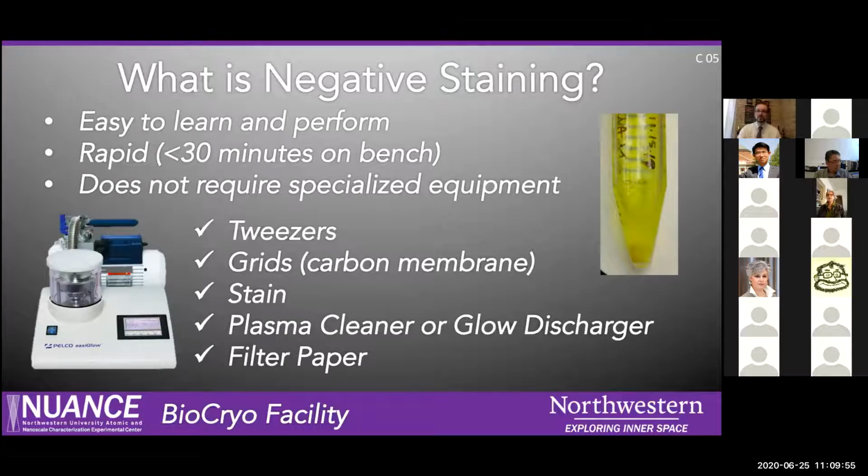It's quick to use as well, and it doesn't really require a lot of specialized equipment. It's usually just what you have around: the tweezers, grids, stain, plasma cleaner, and filter paper.